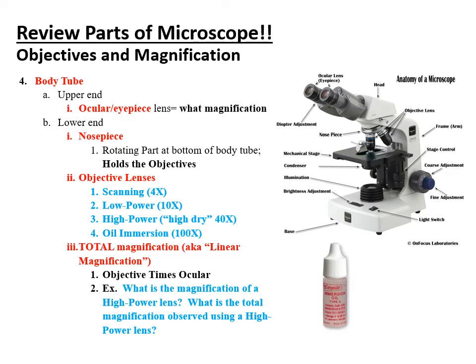Now, please keep in mind during pandemic times that the eyes are a portal of entry for pathogens, meaning that pathogens can actually get into your body through your eyes. So please be careful of where you're putting your eyes lately. I know that sounds weird, but basically during these pandemic times, do not put your eyes up against the microscope lens without having properly disinfected it first.